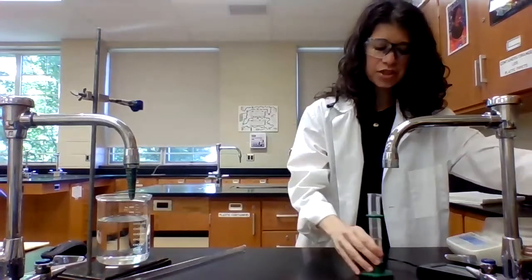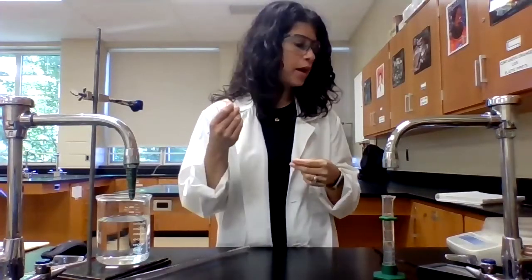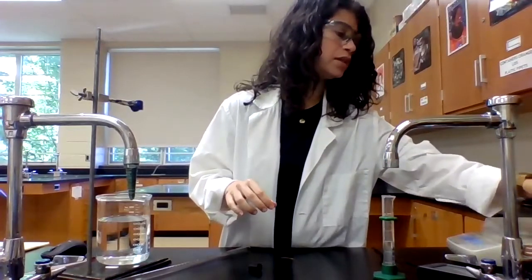All right, so the reaction is going to take place inside this eudiometer so that the gas is trapped. How am I going to do that? I'm going to use a piece of copper wire and wrap it around the magnesium ribbon to secure it to the end of the eudiometer. Then I'm going to use the stopper here to plug the eudiometer so that the reaction can take place. I'm going to take my magnesium ribbon and fold it in half so that I can more securely wrap it.